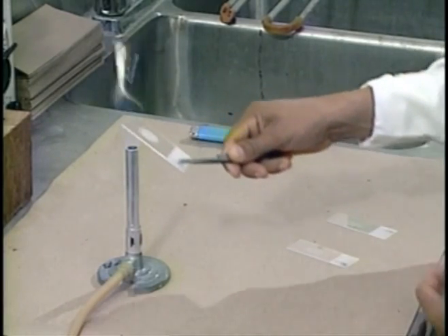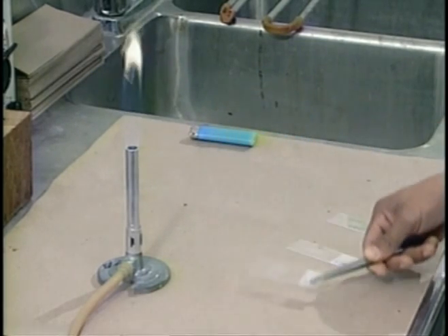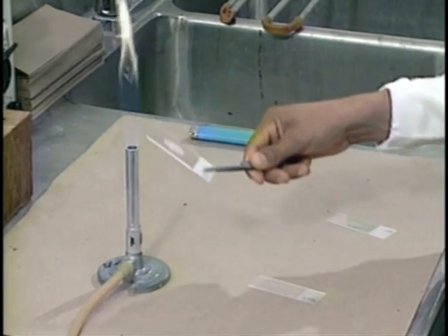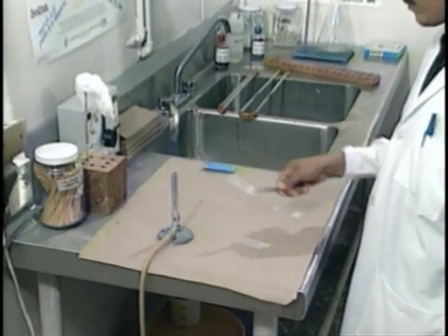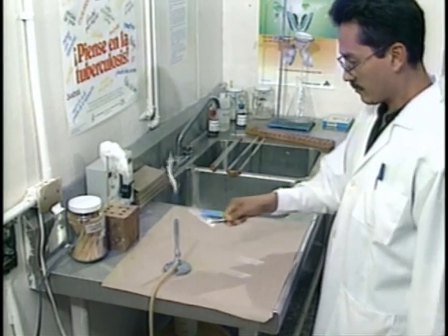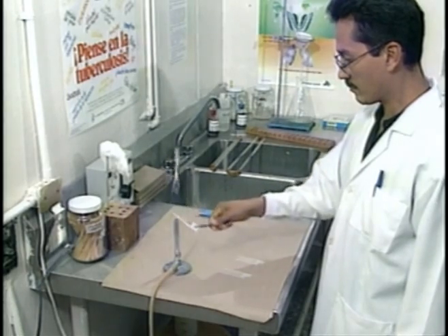When dried, fix the slides using the blue flame of a Bunsen burner. With forceps, pass the slide briefly through the flame 3 times, smear side up. Heat fixation ensures that the sputum will stick to the glass slide. Excessive heating could damage the bacilli. If not sufficiently heat-fixed, the acid-fast bacilli may wash off during staining.